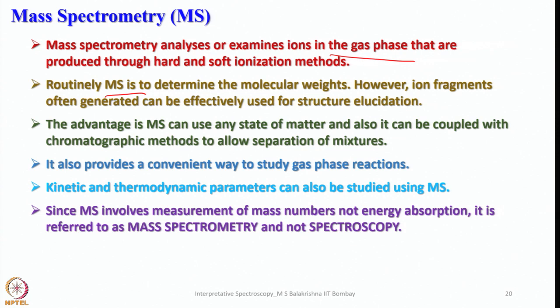It also provides a convenient way to study gas phase reactions. Often gas phase reactions are very difficult to monitor using other spectroscopic methods, whereas here we can conveniently study and understand the mechanistic pathway and several other things about kinetics. Kinetic and thermodynamic parameters can also be studied using mass spectrometry. That's another advantage of mass spectrometry.